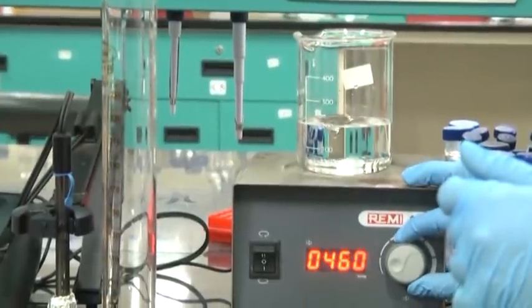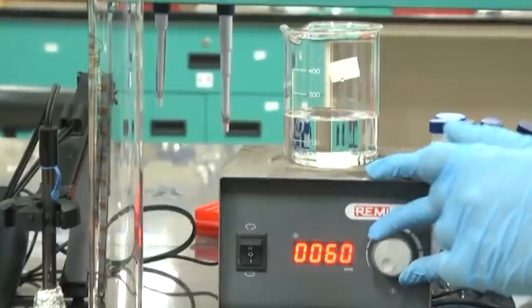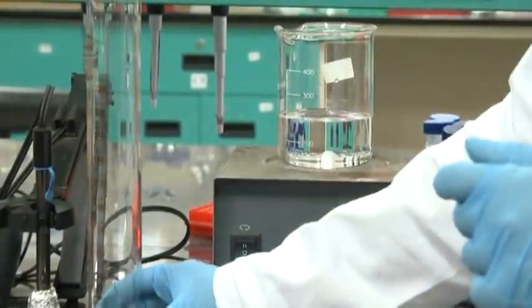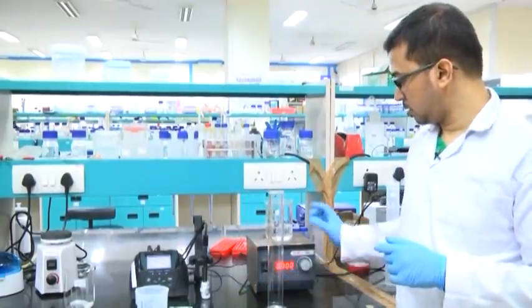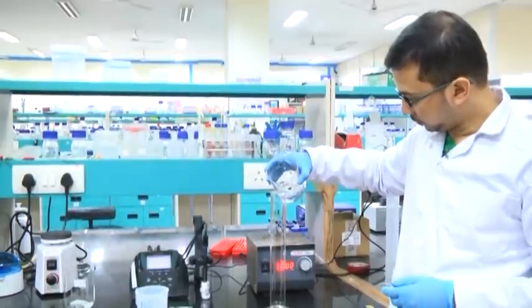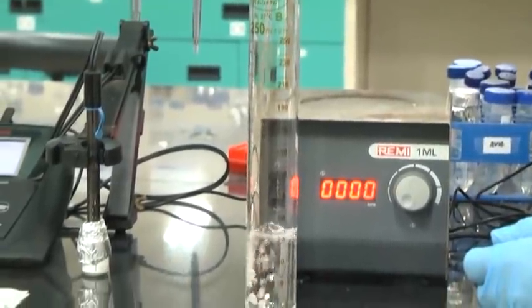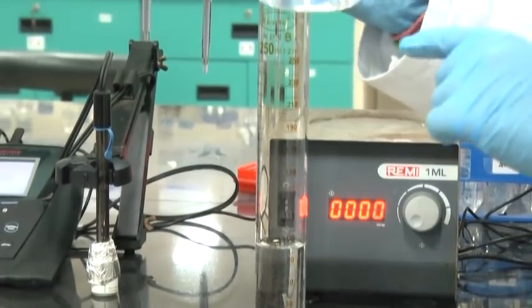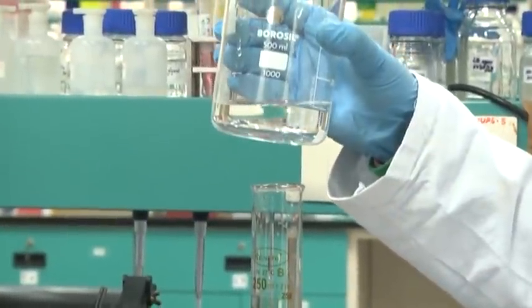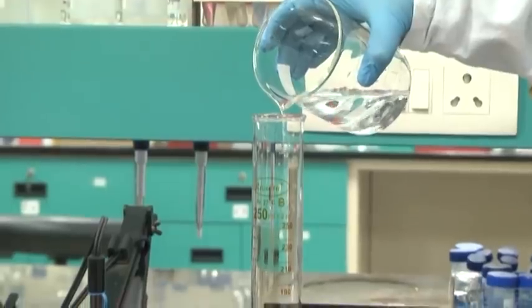To stop the magnetic stirrer, decrease the speed initially and then switch it off. Now I will be pouring the solution out here. Please note — the magnetic bar out here: do not let it drop into the measuring cylinder; be careful while transferring the solution into the measuring cylinder.